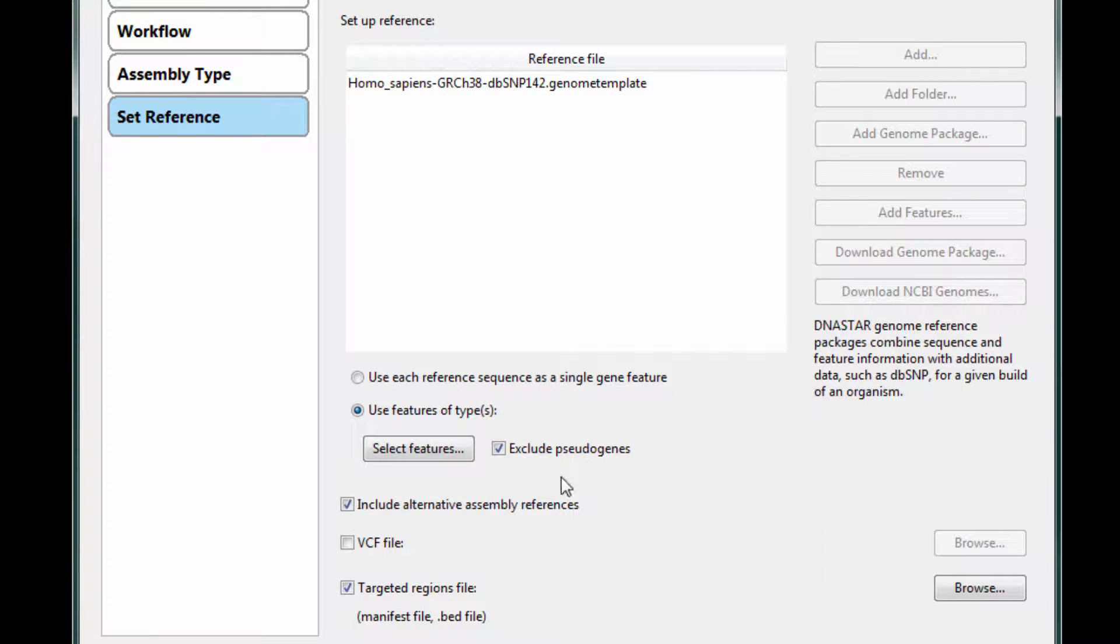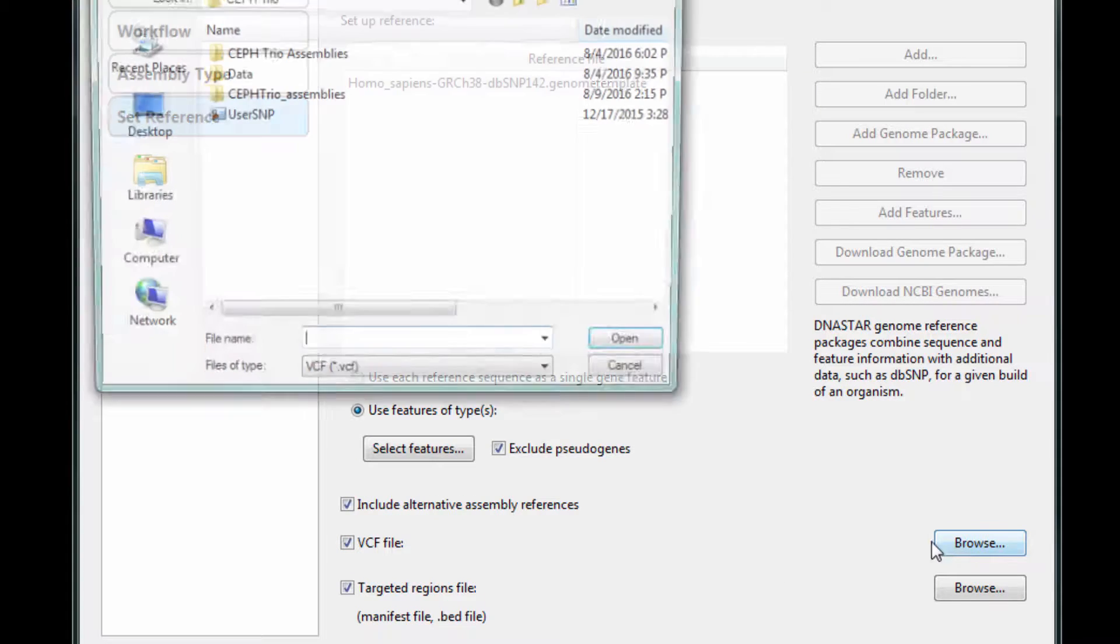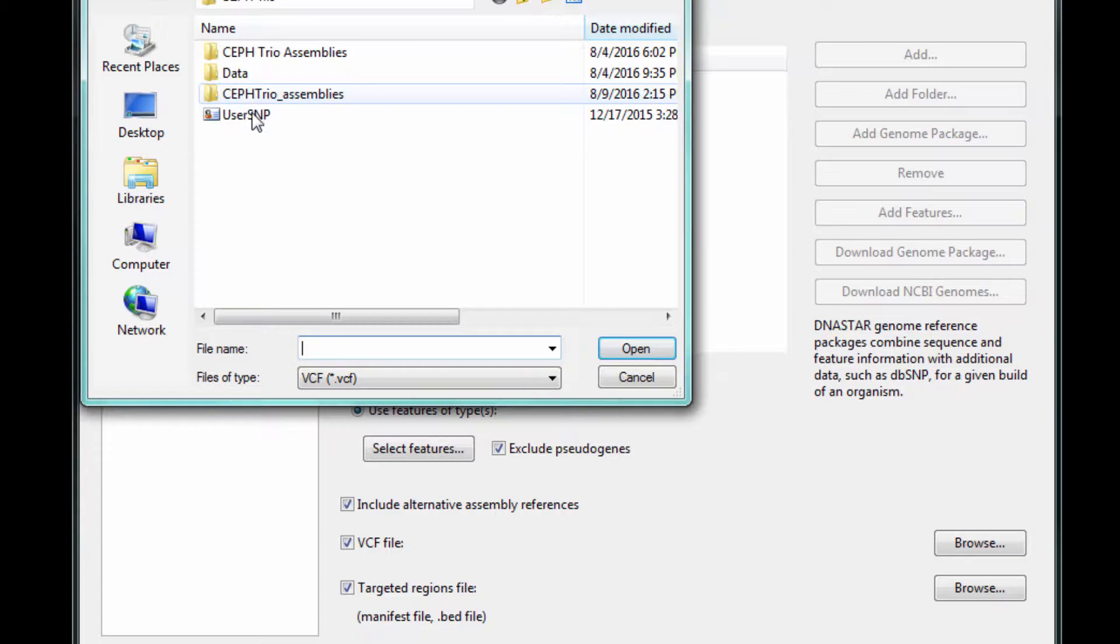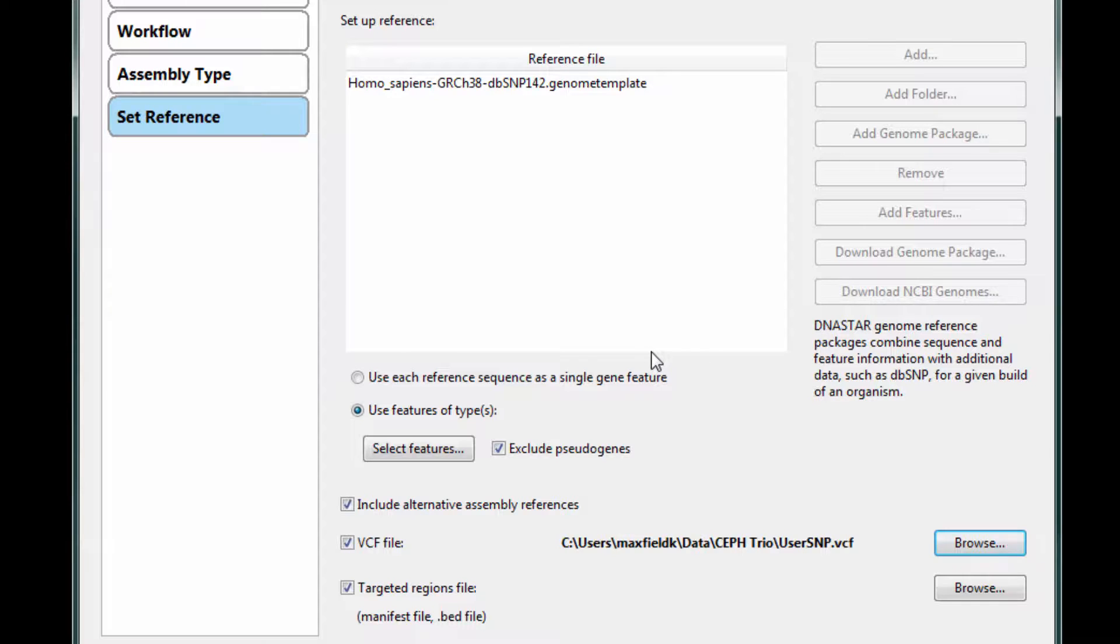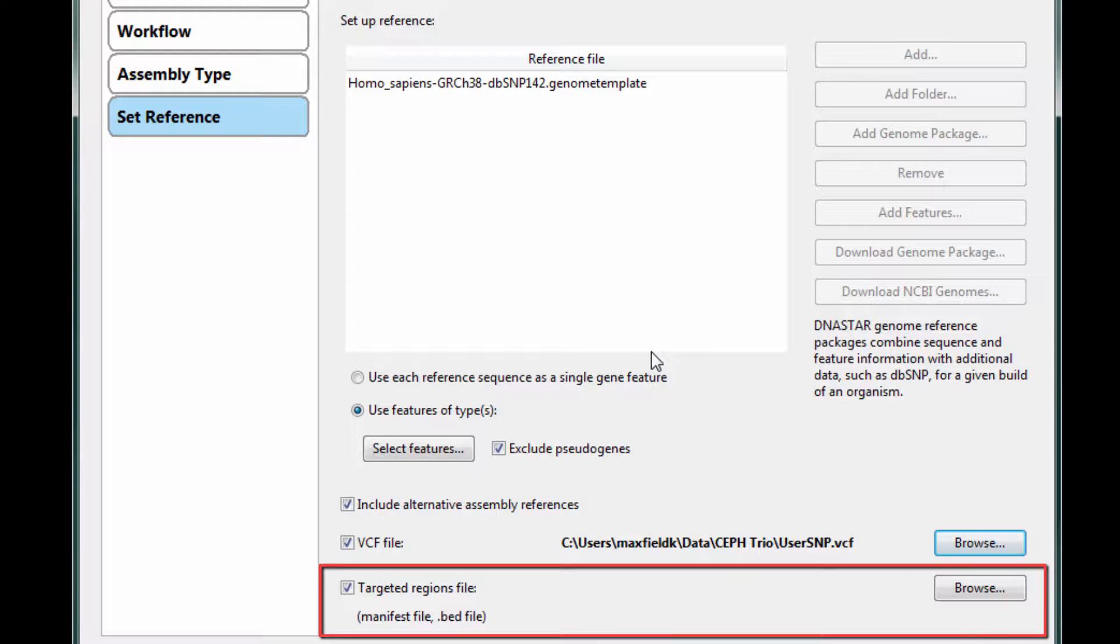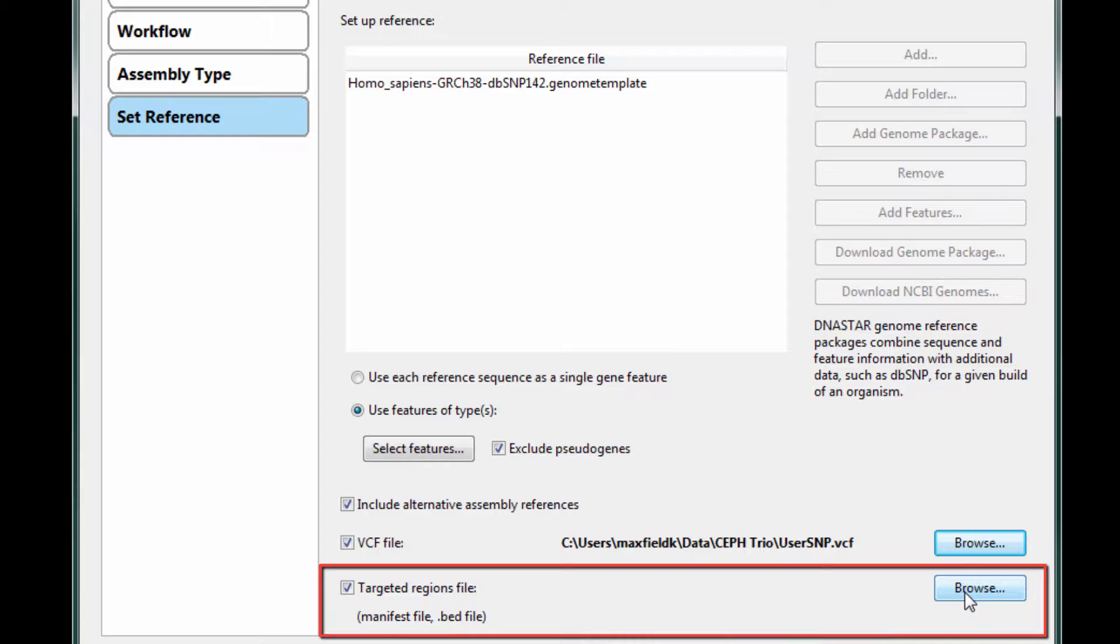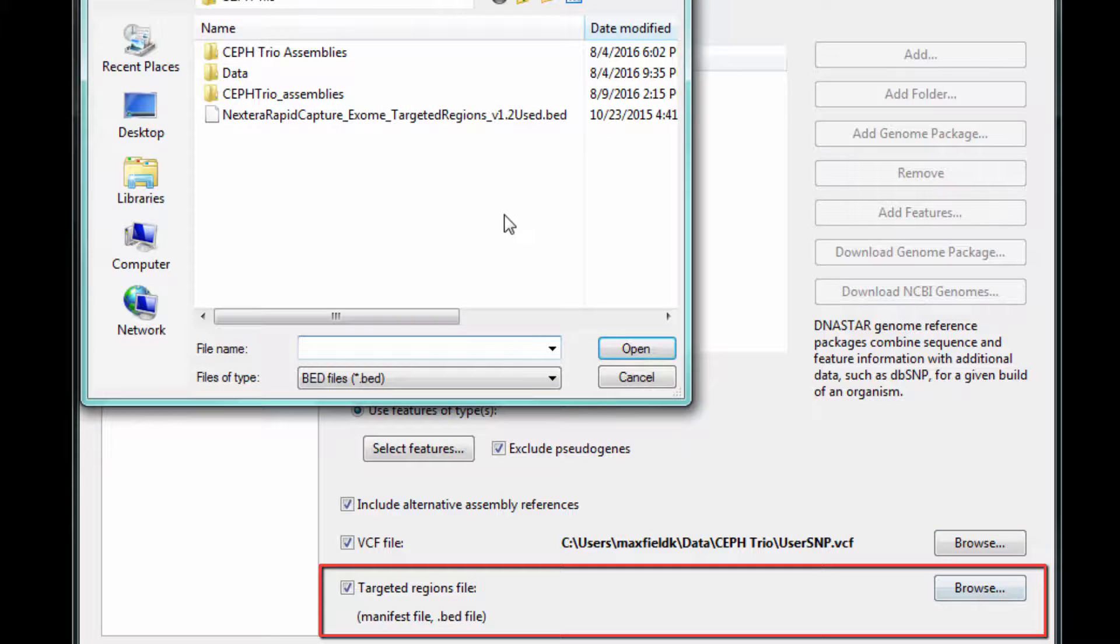On this screen, you can also load a VCF file if you have a custom SNP database you want to search against. And because we're working with targeted resequencing data, we also need to load a BED file that defines the target capture regions.